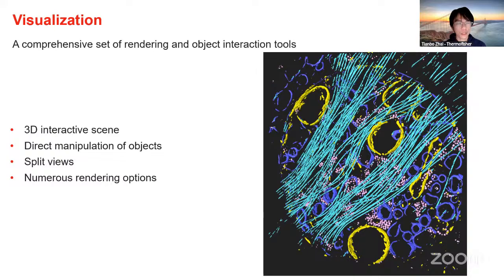But note, at this point nothing has been done physically to the data set. We're still just visually inspecting it, and we may adjust the so-called color map to help us view it a little better, but no actual physical change has been made to the data set. It is considered visualization, or you can say inspecting your data before analysis.